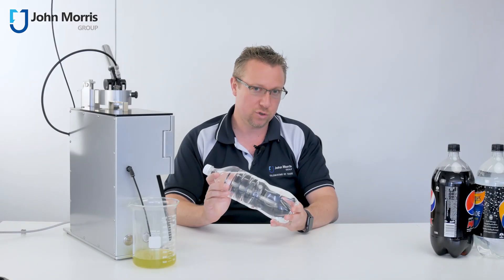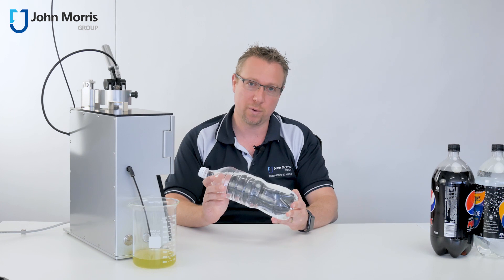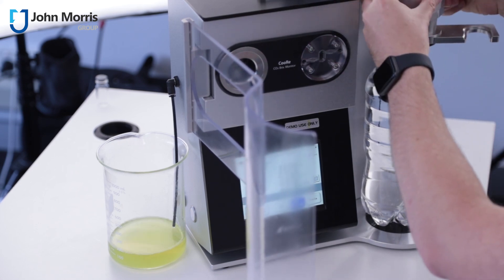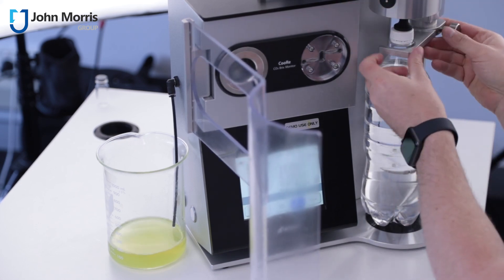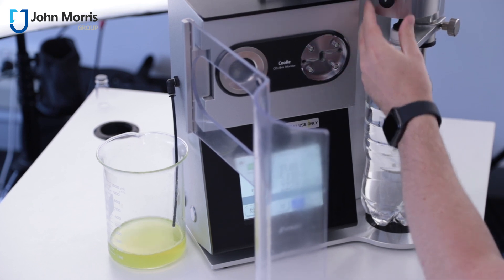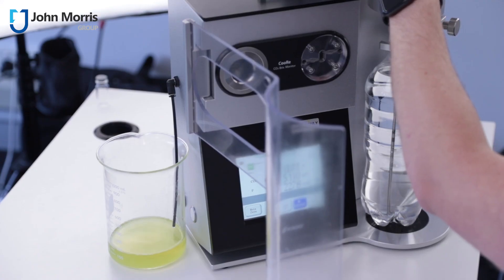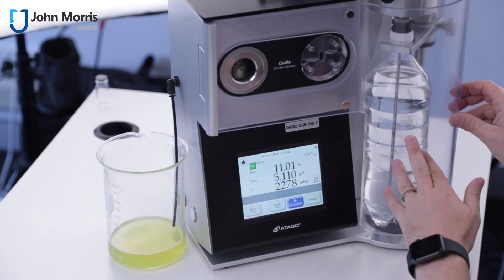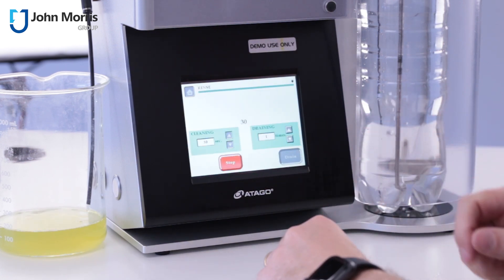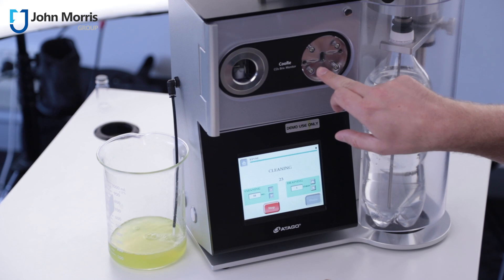So after you've finished taking your measurements, you should clean the measurement cells out with demineralised water. You can also zero or calibrate the refractometer component with water. Let's clean it out now and just see how it does. And you can see the measurement cells here are all rinsing.